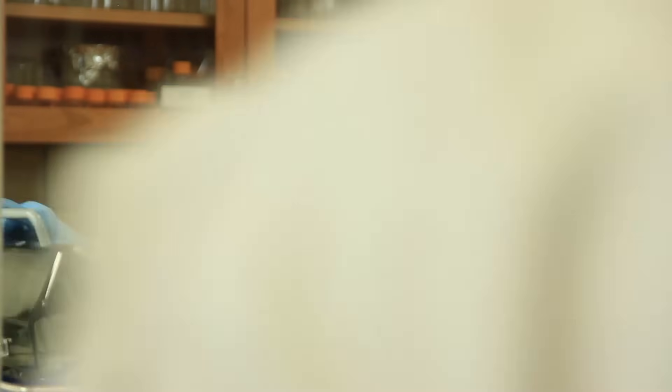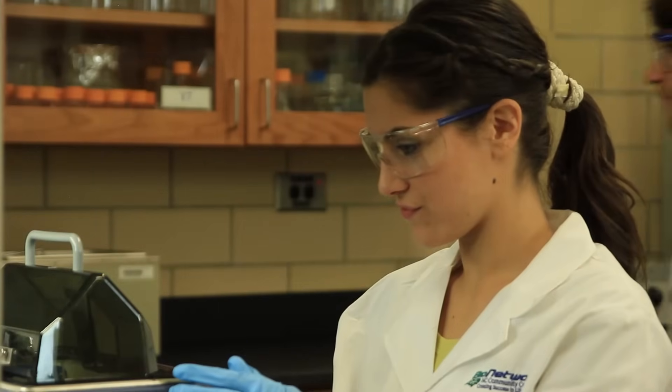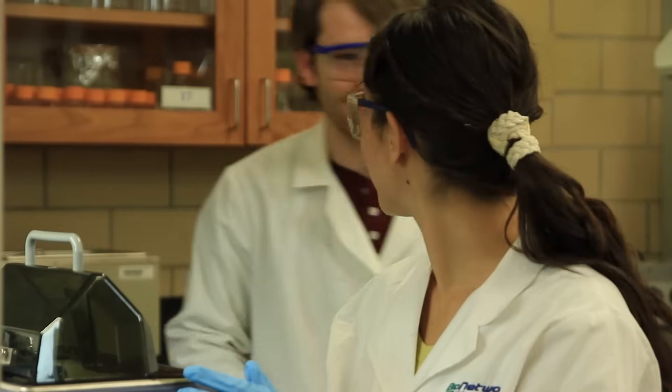Never work alone. Always have at least one other person in the lab so that you can help each other in case of an emergency.